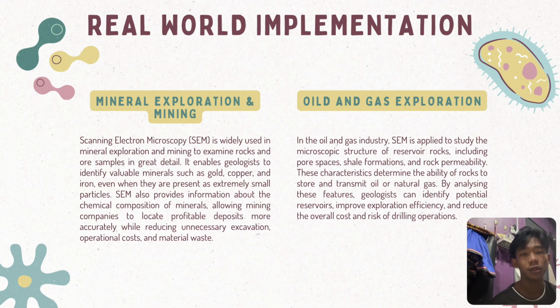Similarly, in the oil and gas sector, SEM is applied to study reservoir rock, analyze pore space, and determine permeability. This data helps locate profitable deposits, improve drilling efficiency, and reduce overall operation costs.